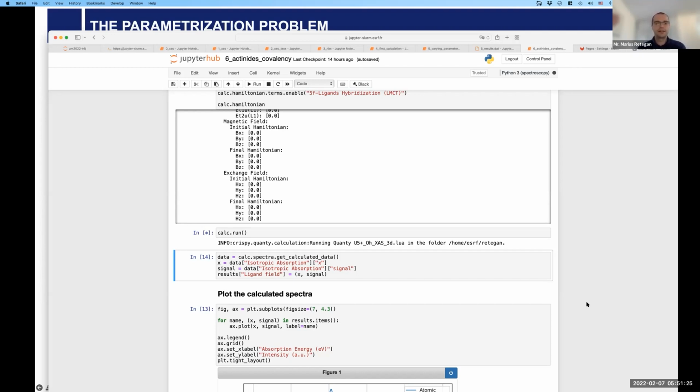I see. But what I really like, and I would like to make this point in the end, is if you sit at a beamline and you document all you're doing, like writing a journal of what you have done during the experiment. When you come in at the beginning of your experiment, you open a Jupyter notebook and start loading your data while you're doing the experiment. So you don't write a written lab journal, but you do it this way and you always see how it's documented. I think for this use it's useful. So, okay.